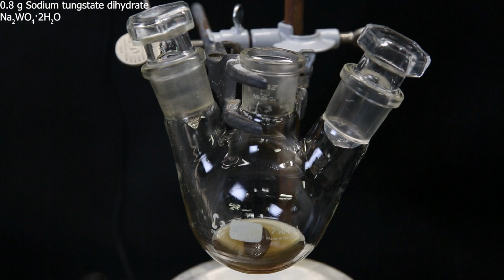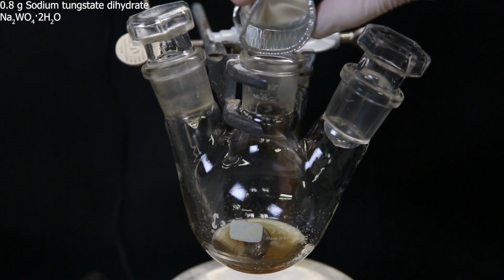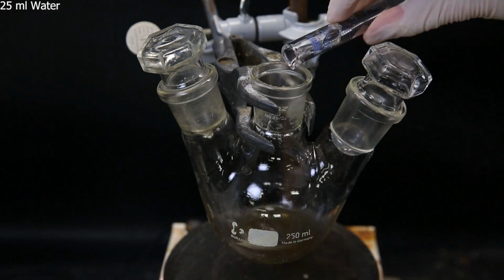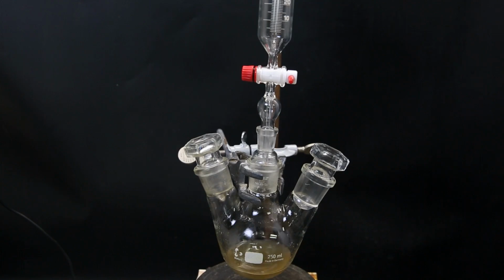Now for the final reaction, I add 0.8 grams of sodium tungstate dihydrate as a catalyst. I start stirring and the solution has darkened slightly. I then add 25 ml of water to dissolve the catalyst. Then to the middle neck, I have added an adapter with a small dropping funnel.